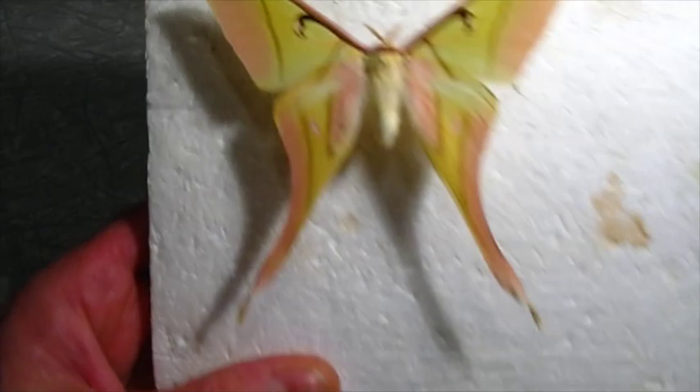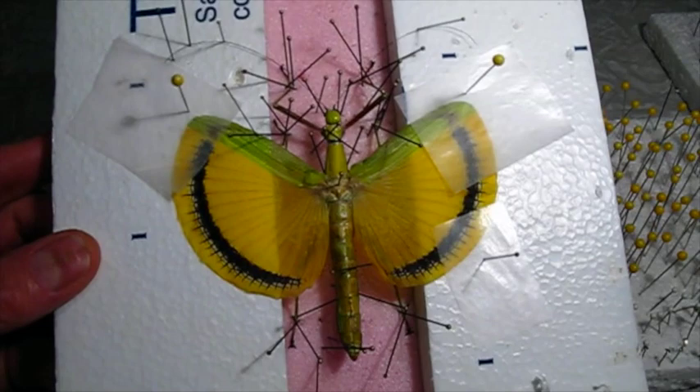That looks really good. Very nice. And then the stick bug — I didn't make a video of pinning up the stick bug because I have another video that shows you how to do that. But this one's also dry, so I'm going to pull all these pins out.